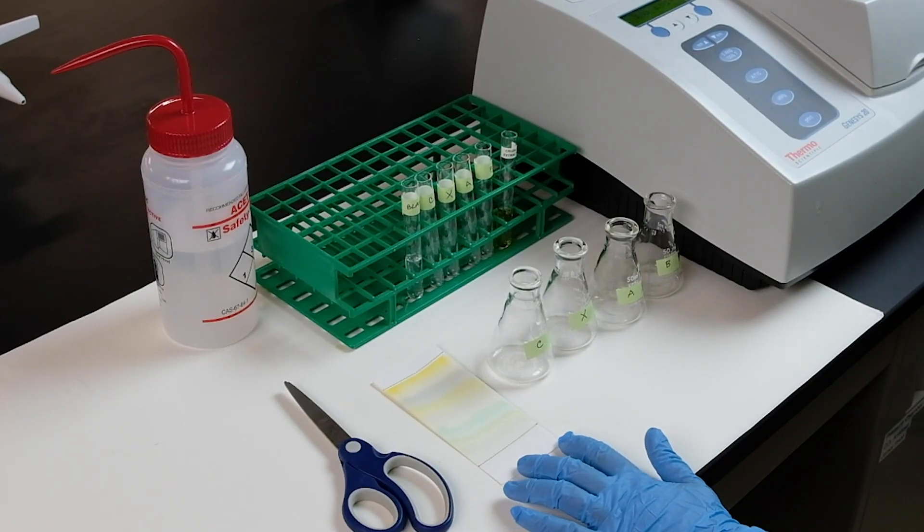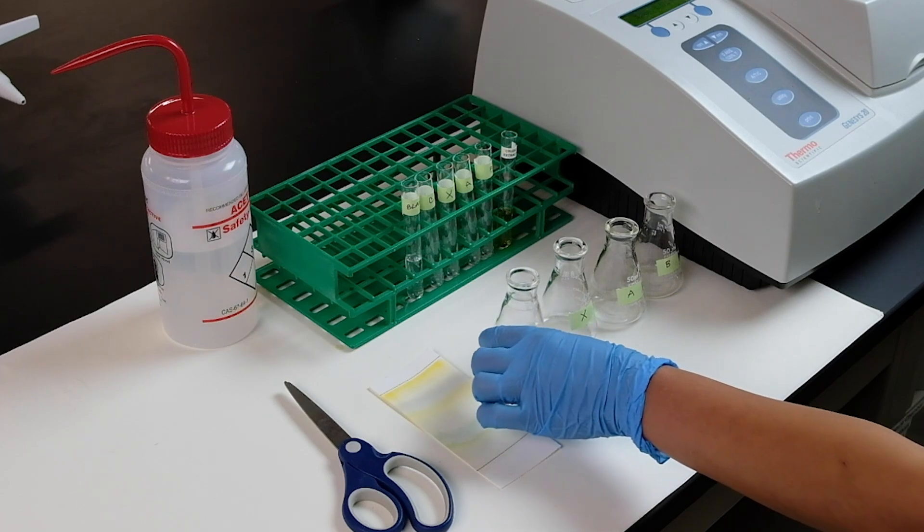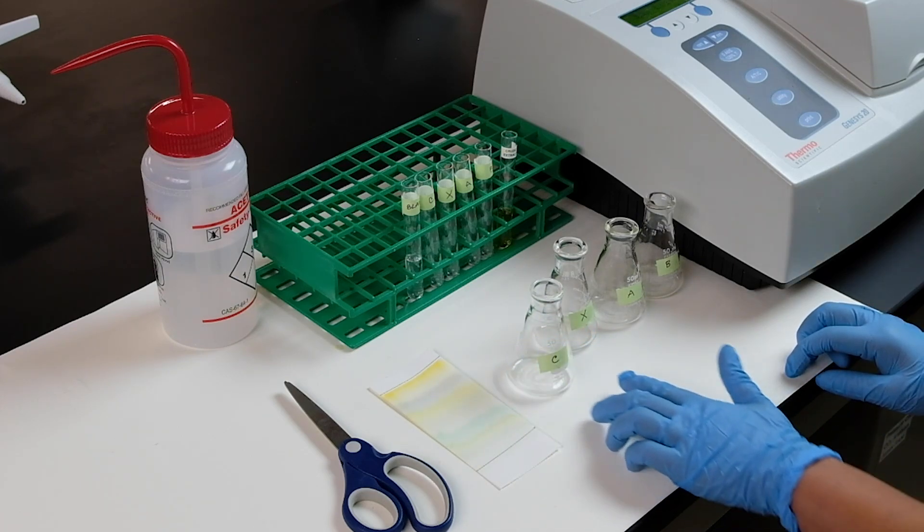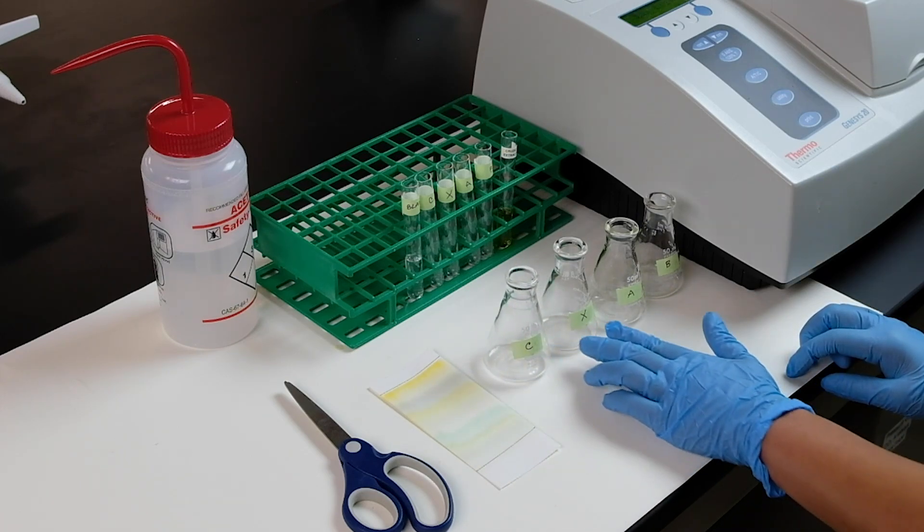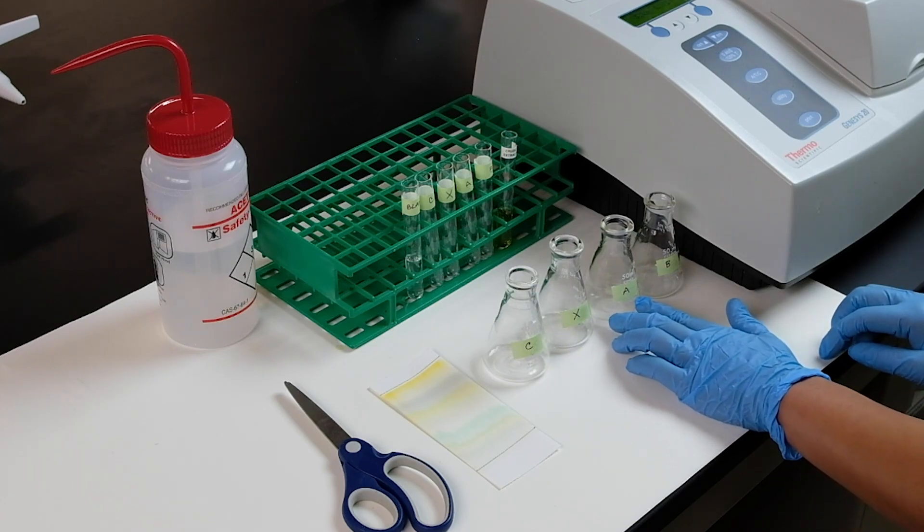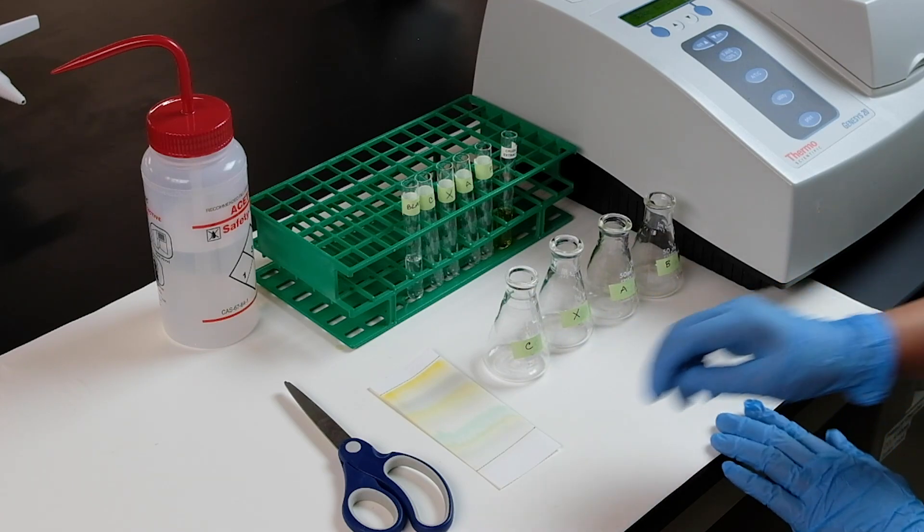Now, you cut each pigment and deposit them in each corresponding flask: C for carotene, X for xanthophyll, A for chlorophyll A, and B for chlorophyll B.